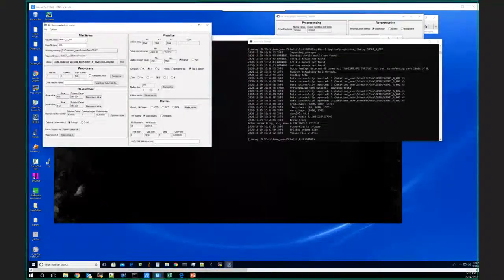In my experience, I think that's harder, but I'm not an expert in it. Maybe there are good algorithms out there for doing that. Obviously those are things that are going to show up in some FFT, and you should be able to filter them out. The question is, how well can you do that? Yeah, I use Avizo and Geos. Okay, cool. And so there is ring artifact removal in that on the reconstructed images. Yes. Okay.